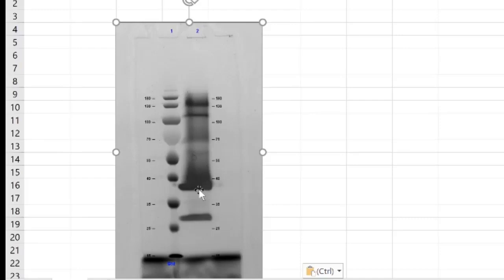For example, other diphenolic compounds that can form quinones, that can attach to a protein, or that can lead to the formation of larger molecular weight species towards the top of the gel. You can also have protein damage or protein decay in the form of losing some pieces of your protein, and that might have happened to the smaller piece that you see here on the bottom.